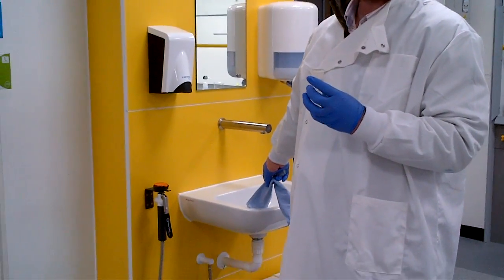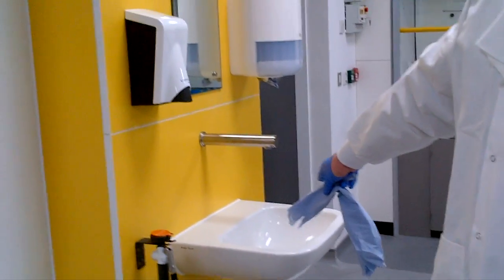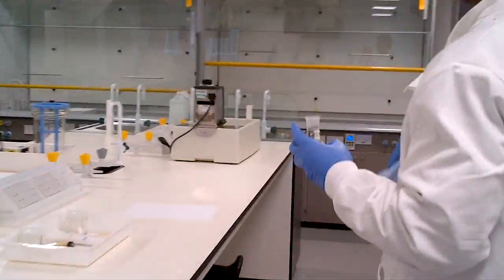We go to the sinks on the benches. Can I just say we never use these sinks in this lab to put any solutions down. This is only for hand wash and face wash in case of emergency. So we can either go to these drip cup taps, or we'll go towards one of the edge benches.